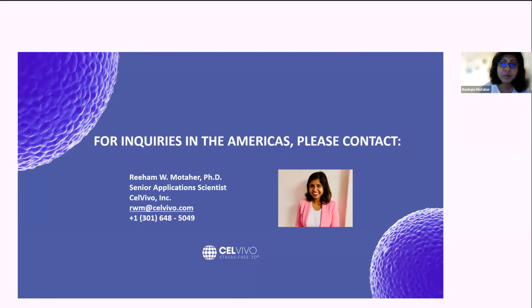Perfect. And another question that will be of interest to you: how would one optimize the RPMs for my cell line? That's the whole thing about the CelVivo, and it's not the first time I'm getting this question. I always say, fortunately, the speed adjustment is based on physics, not on biology. And since we understand physics much better than biology at the current time, it's basically a function of mass, surface, and viscosity of your liquid.